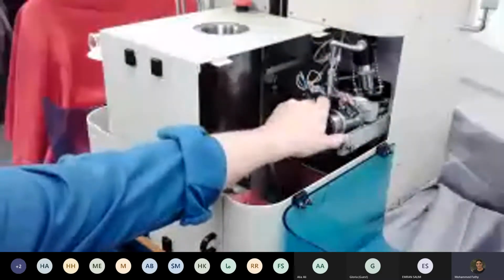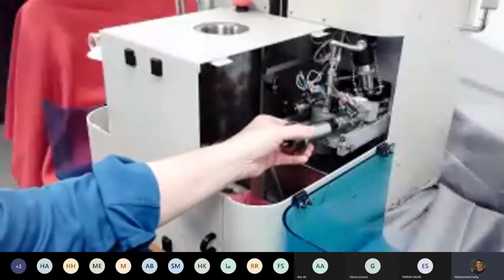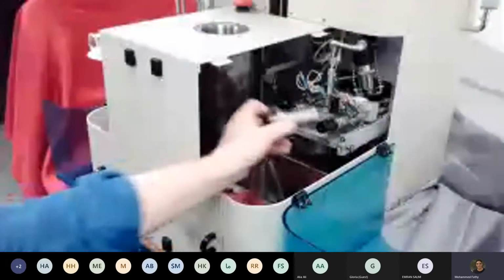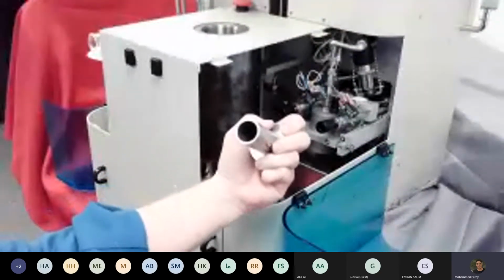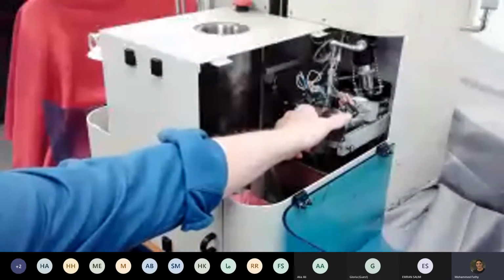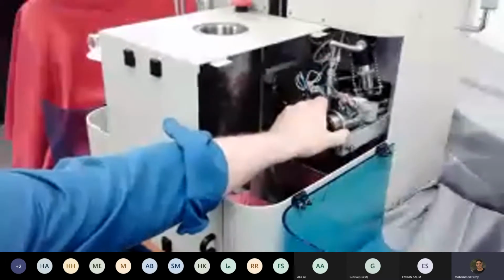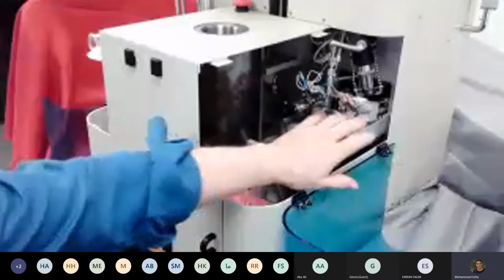The first one I want to show you is this interlock system. So there are micro switches here, and the system has to be engaged with this micro switch here. These are what are called bayonet fittings, and these secure. This is part of the sample cell holder. I'll show you that completed in a moment. And this has to be in this position, so the sample cell cannot be removed at this point, but it must be in this position to run.